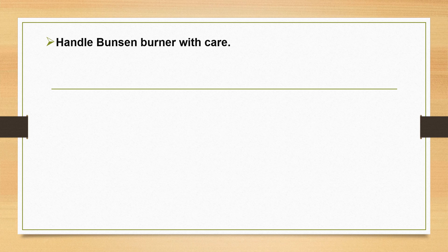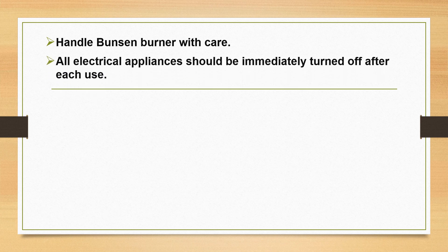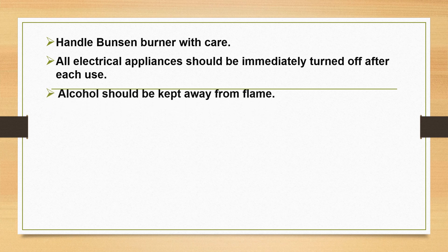The Bunsen burner should be handled with care as it is very dangerous, and it should be turned off when not in use. All electrical appliances such as ovens, autoclaves, centrifuges and other devices should be immediately turned off after each use. Alcohol should be kept away from flames, as alcohol catches fire easily and may result in accidents.